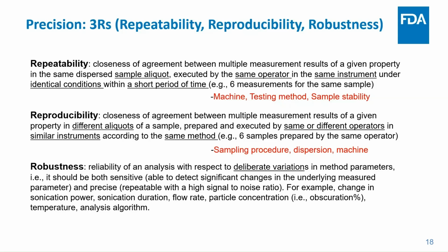It's the 3 R's. As you can see, this is a matter of effort: as long as one sticks to the procedure, sticks to the 3 R's, everyone can do the precision right. And as long as they optimize the procedure, pay attention to the instrument settings, and make sure the instrument is properly maintained, it's relatively easy to achieve the precision.